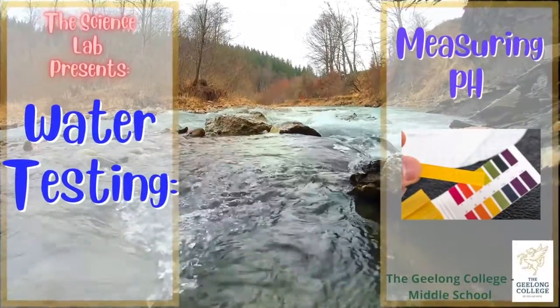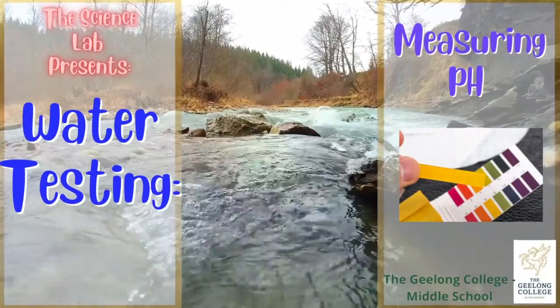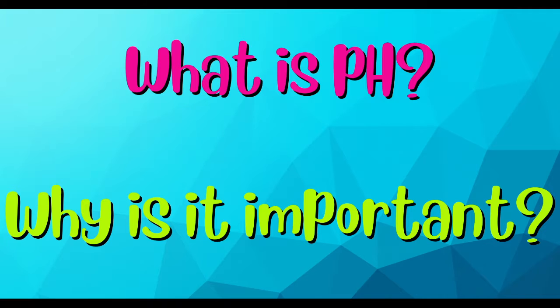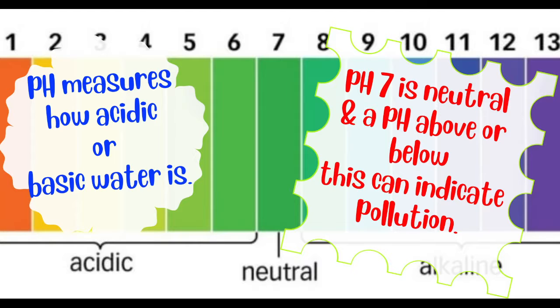Today we're going through water testing and learning how to measure pH. We'll be using this water test kit to test our water samples. But first, what is pH and why is it important?